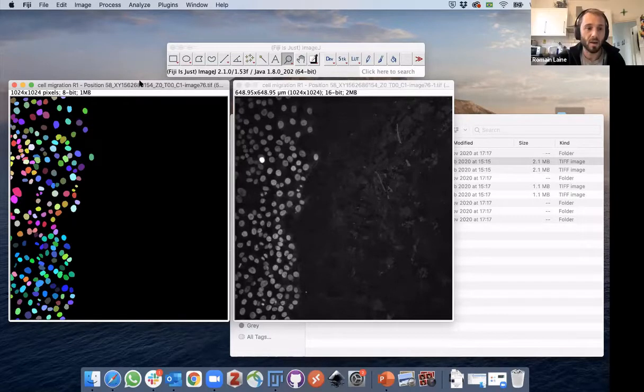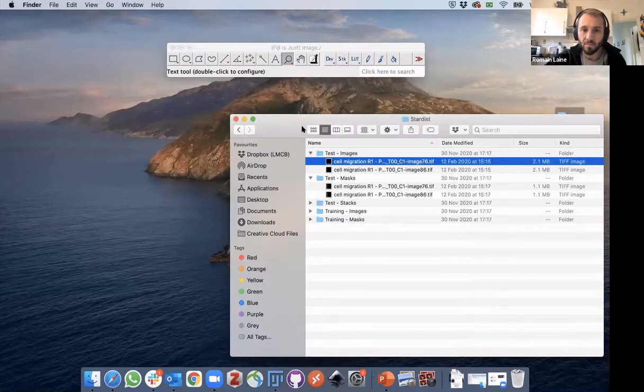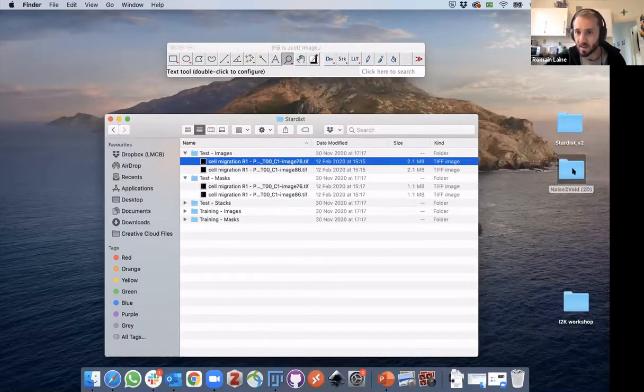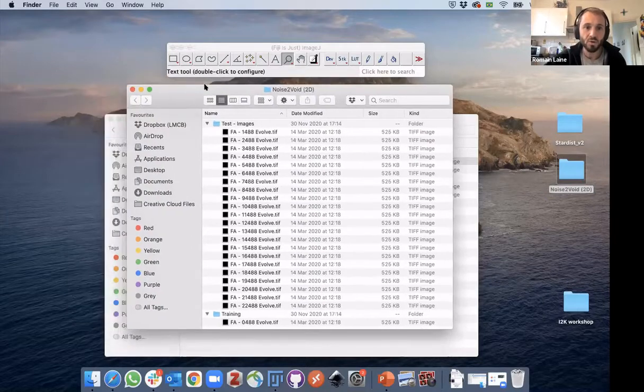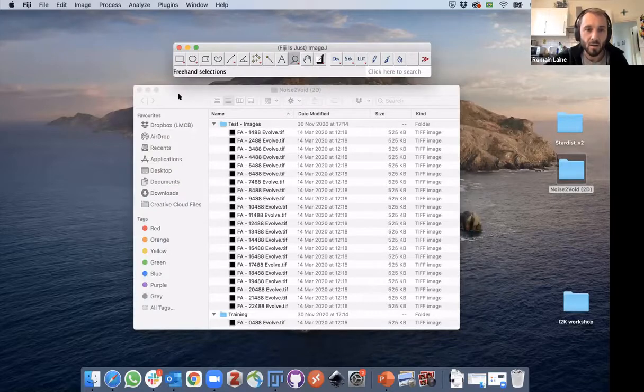Thanks. Yeah, that's right. And in this particular case of StarDist, it'll be estimating the probability of an object being there and the position of the different radial directions that it's looked at, right? That's why it's looking at star-shaped objects. Yeah. So thanks for your comment, by the way. That's great. In fact, we will not start playing with StarDist, but we'll start playing with Noise2Void, just in the interest of how we've structured this workshop.